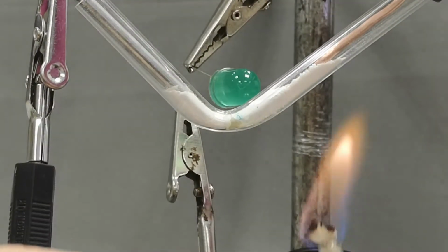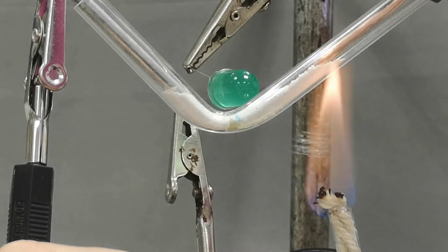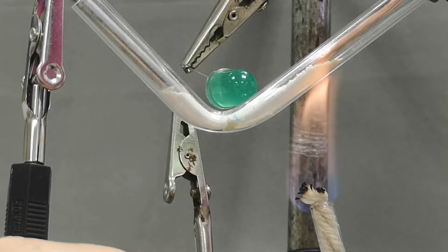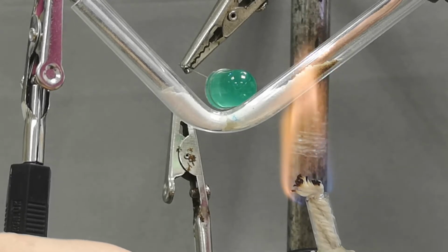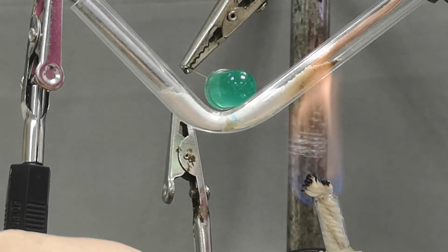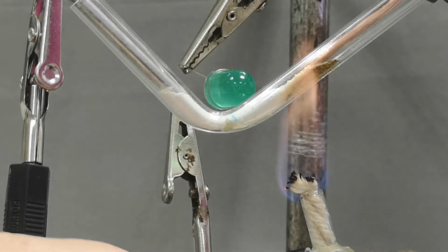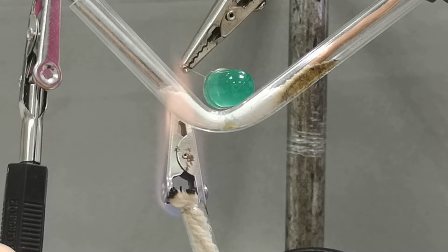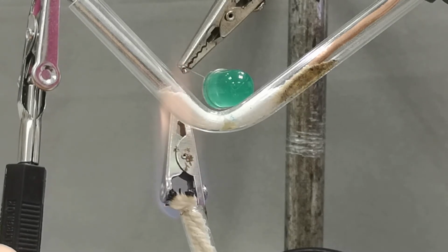A good demonstration of this is to try to pass a current through a solid salt, without success, and then to melt the solid. This particular example uses lead bromide as it has a very low melting point. It's being done here on a microscale as the reaction gives off toxic fumes of bromine.